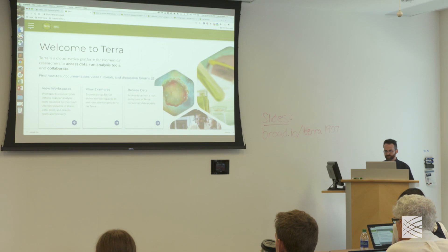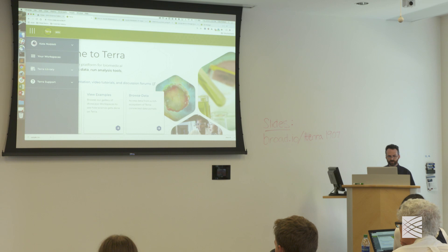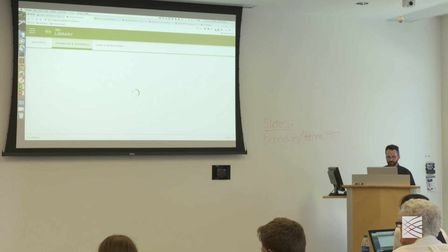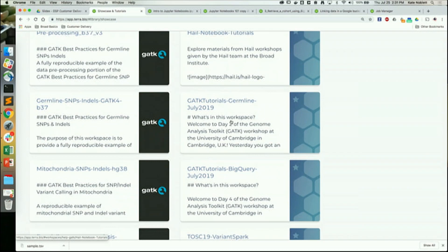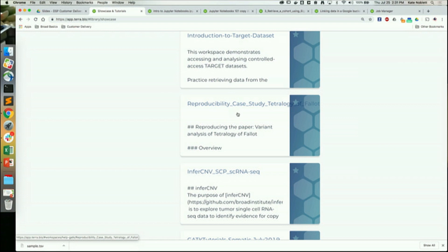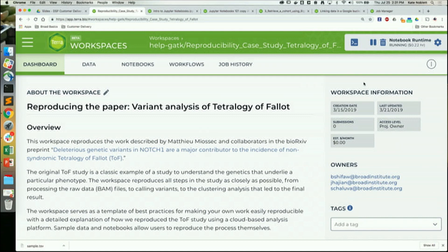We're going to start by cloning the workspace, then I'll go back to some slides to give you context for what the study is about. In the meantime, if everyone can please go to the Terra library — click on the hamburger menu, go to the Terra library, into the showcase section, and find the featured workspace called the Reproducibility Case Study: Tetralogy of Fallot.